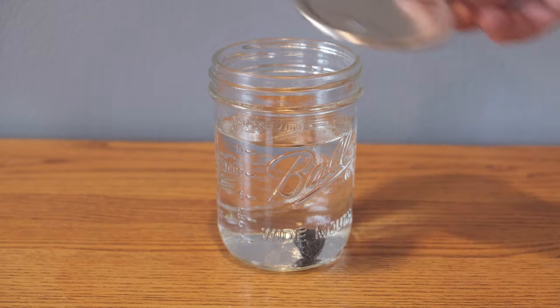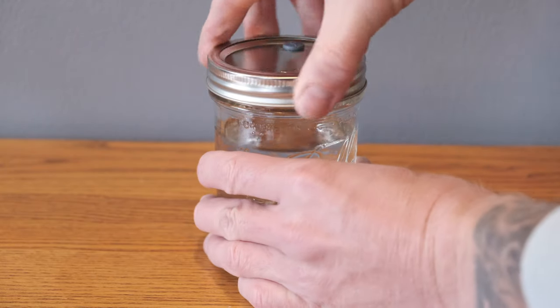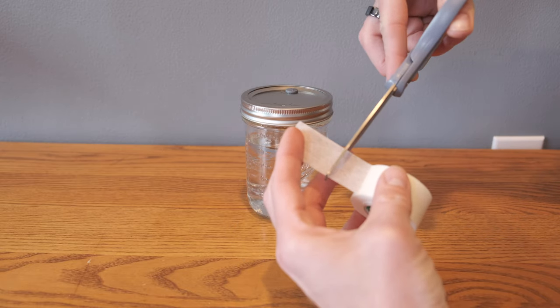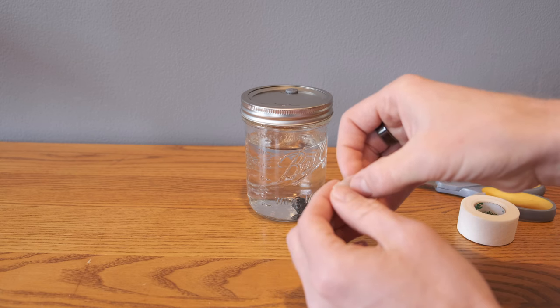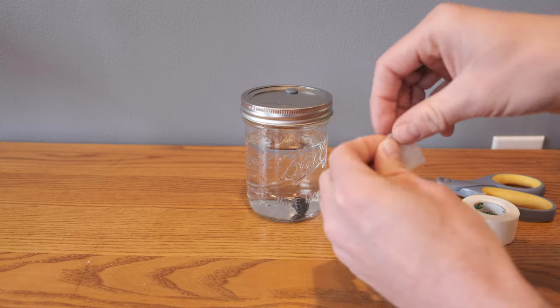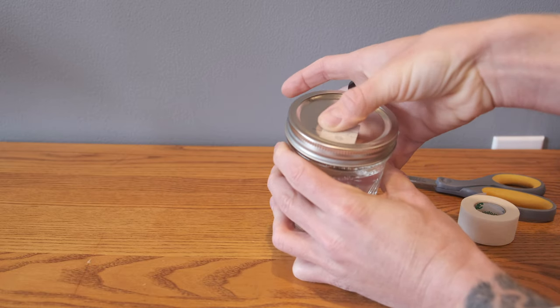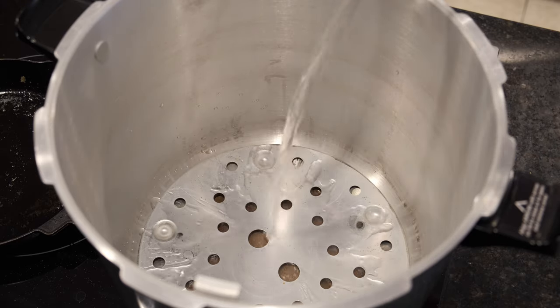Then I install the lid and ring, and place a piece of micro pour tape over the vent hole. Here I like to give a gift to future me by folding the end of the tape over. I don't bother putting tin foil over the top on liquid culture jars and just load it straight into the pressure cooker — and as always, don't forget to add water to the bottom of the pressure cooker.